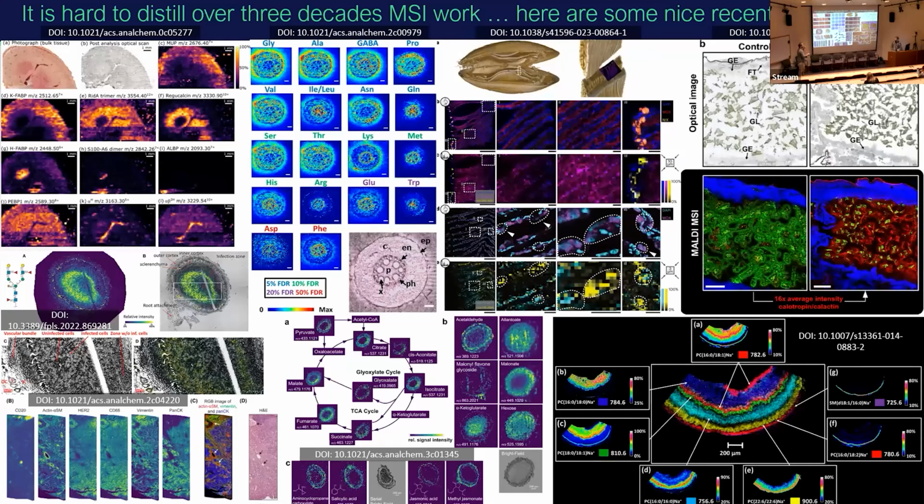And in the bottom right-hand corner, bringing it back to a little bit of the NIH space, if you think of the human eye that you're using right now to look at this presentation, there's diversity within the lipids. In terms of the lipid classes themselves, phosphatidylcholines are just one of these lipids that are very important in terms of metabolism, but we can see that they're incredibly diverse, not only in their spatial localizations but within these fine layers actually controlling a lot of different portions.